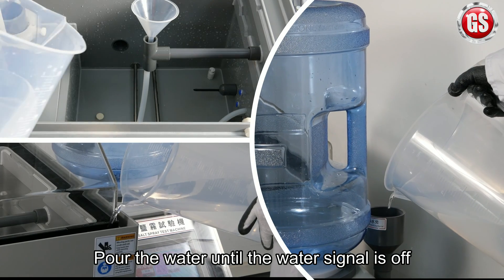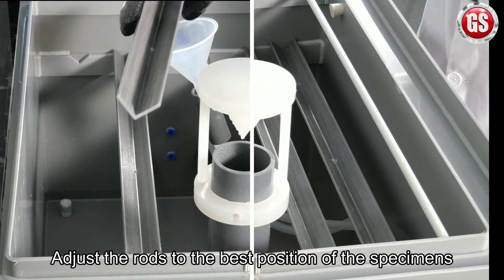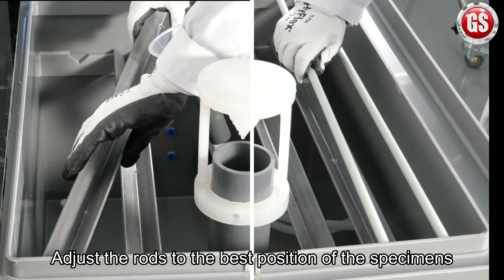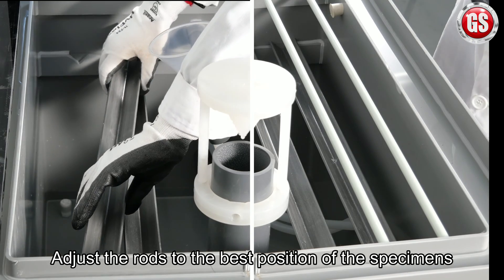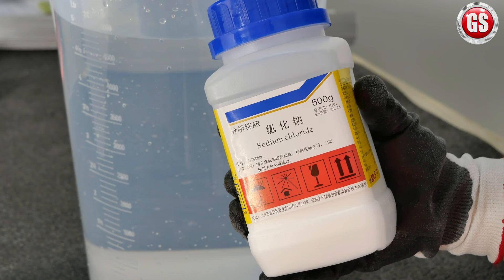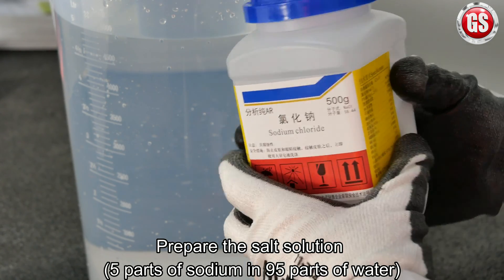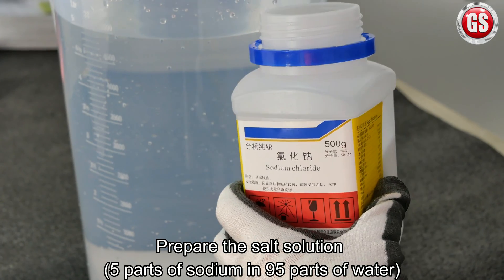First, pour the water until the water signal is off. Then adjust the rods to the best position for the specimens. Prepare the salt solution — it should be five parts of sodium in 95 parts of water.